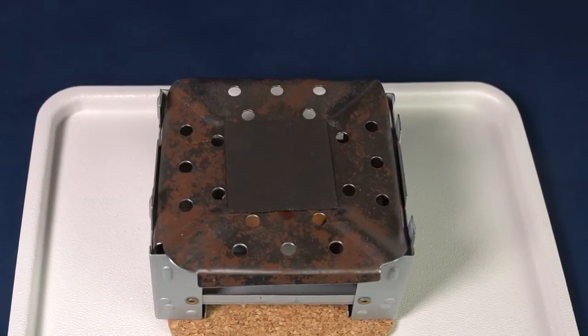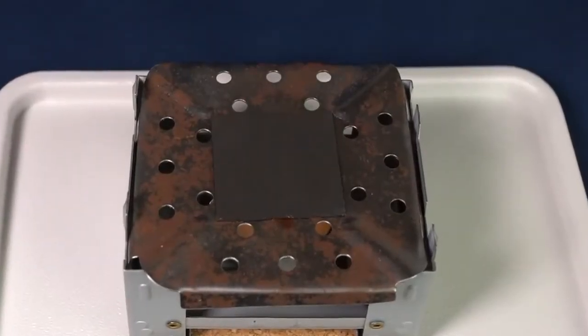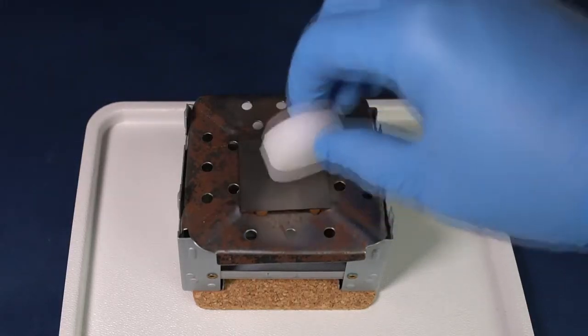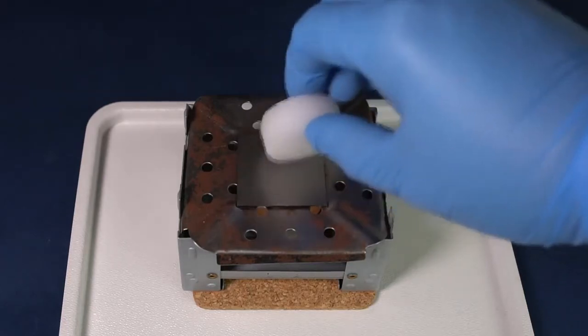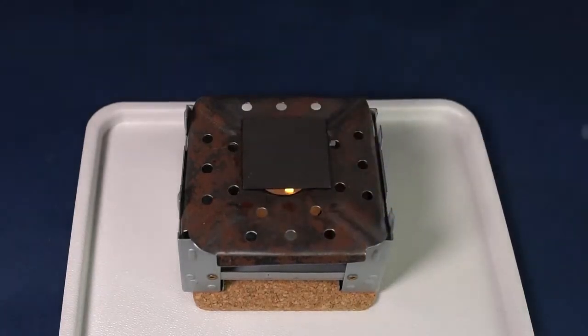For this experiment, first we will need to heat the iron plate. The easiest way to do it is to use the solid fuel stove and a candle. Now, as the plate becomes hot, we need to cover it with a layer of paraffin to protect the metal from chemical action. Extinguish the candle and wait until the paraffin solidifies.